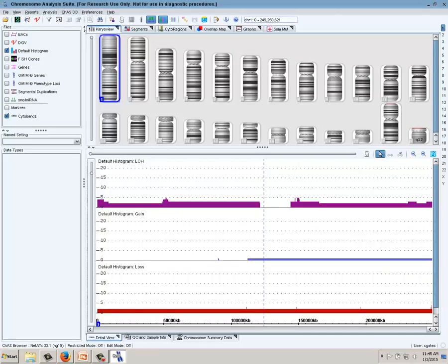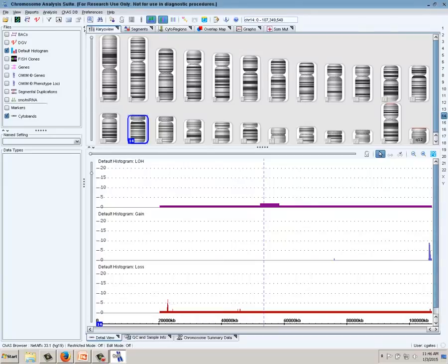So now we can take, and if we're interested, this gives us a nice representation of what's going on in our database and where we've seen segments before. So I'm going to go here to chromosome 14, where we have our nice little spike here to about 9. And I'm going to right click because I'm interested in knowing what I've seen in this particular region of the histogram previously. So I can right click and say show histogram items in that bin.